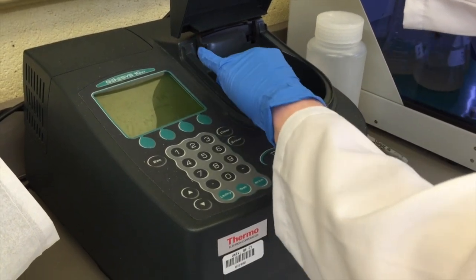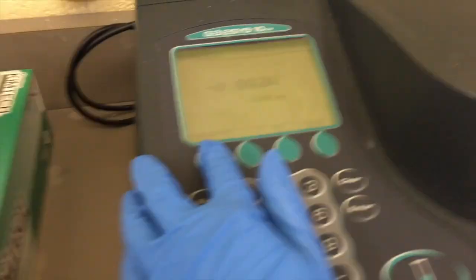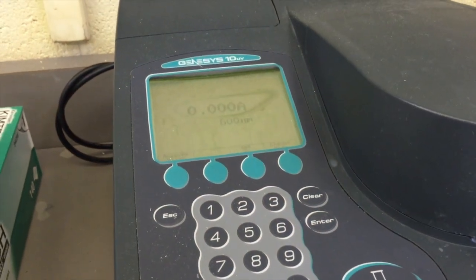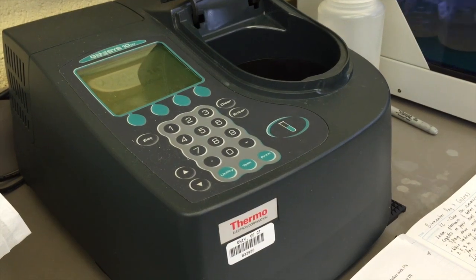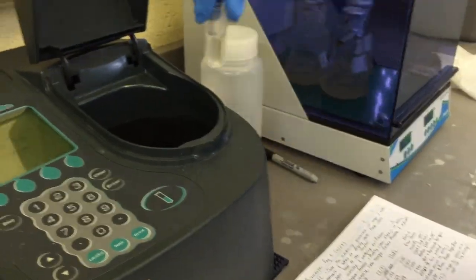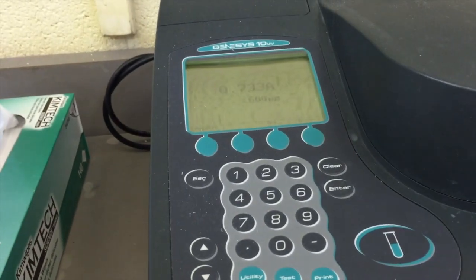Measure the absorbance of the sample, keeping in mind the direction of the light beam, and record the value. Return the flask to the shaker as quickly as possible to maintain proper operating conditions. Repeat until consecutive data points are identical or until the reaction has run for 8 hours.